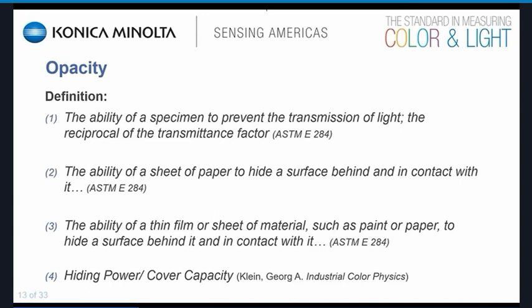The goal today is to go over transmission haze, but we need to discuss opacity just a little bit, as they're usually related to each other, and if you get to a certain haze level, it's often good to move to opacity measurements.